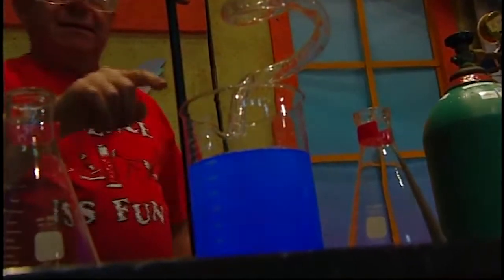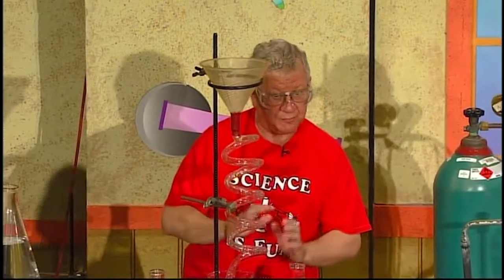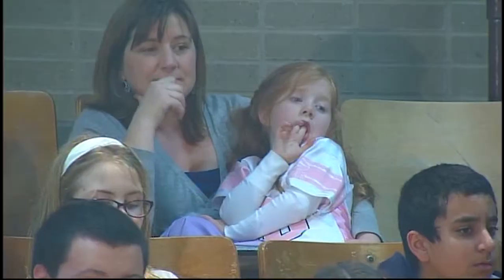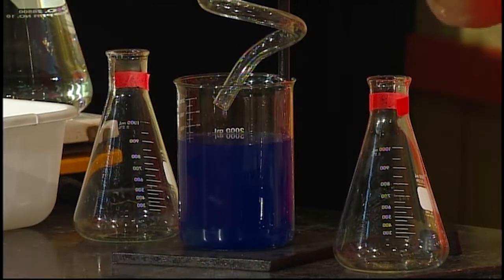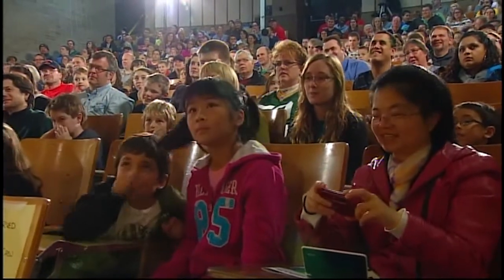Right, with the lights up, please. This experiment shows us the release of energy in the form of light, but not in the form of heat. This is still at room temperature. This chemical reaction is called chemiluminescence. Can you say chemiluminescence? Chemiluminescence. Very good. I hope that before you go to sleep tonight, you will learn how to spell chemiluminescence. It's very important that we learn new words and what they mean and learn how to spell them.